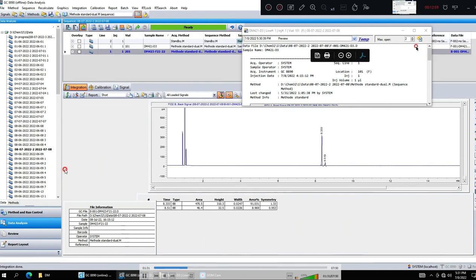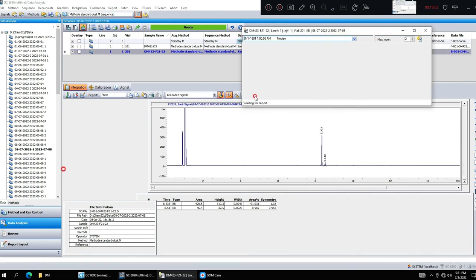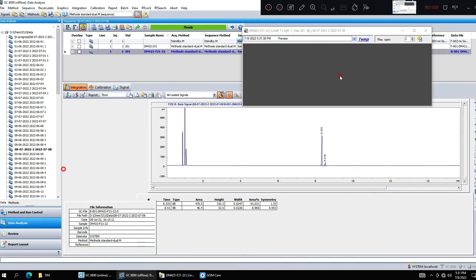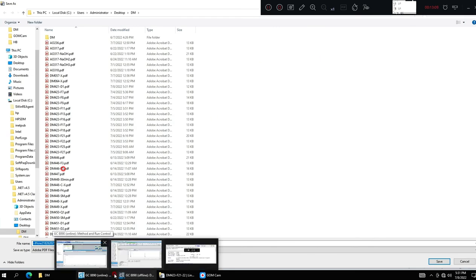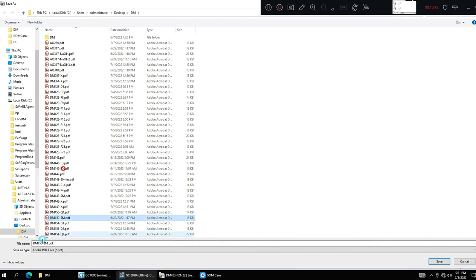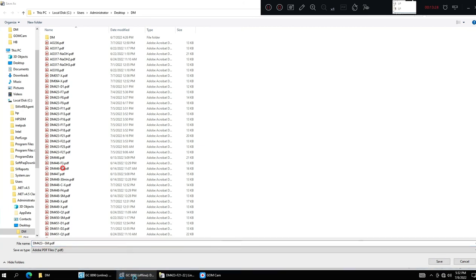The other one, same procedure: review, print report. 423, so you need a little bit of good memory because here you can change anything. So that's a little bit unfortunate, that you cannot check which window was open before. I don't think you can. No, it's complicated.